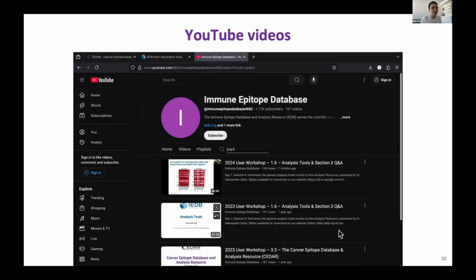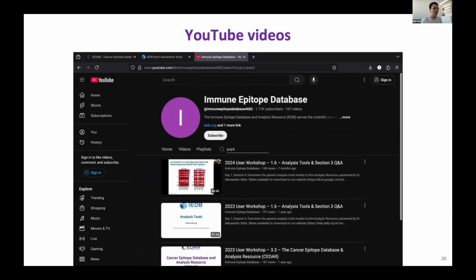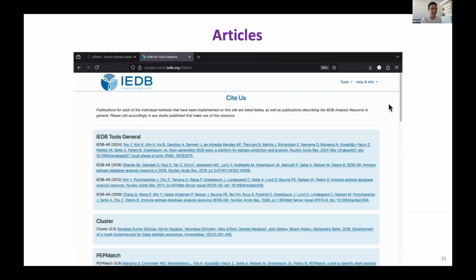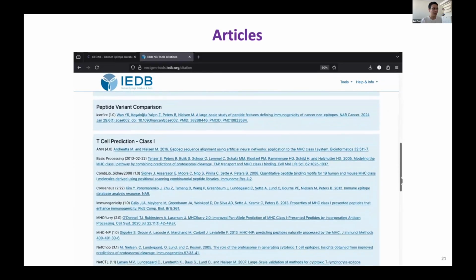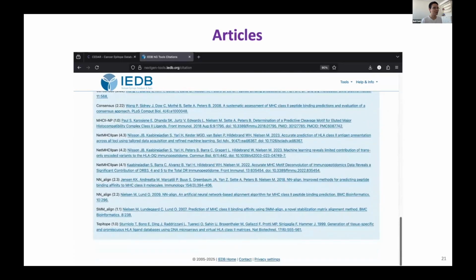So here, for example, I want to learn more about pepX. So on our YouTube webpage, I'm looking for videos associated with pepX. And also we provide all of the publications that are related to our tools. So if you go to the Help and Info drop-down menu, you can see that there is an option which is Cite Us, and here we provide all the papers that explain the science behind all the tools.